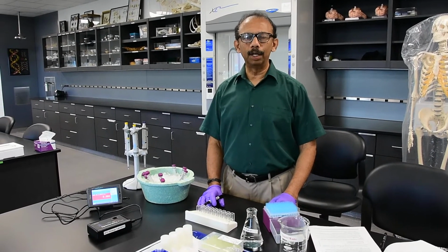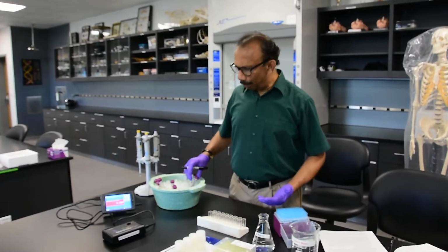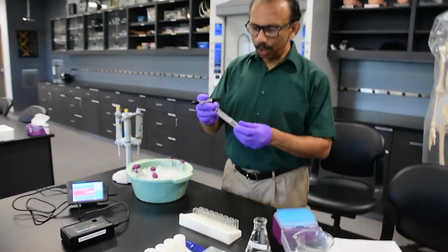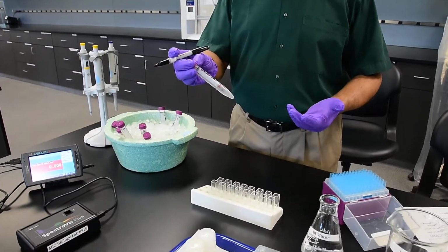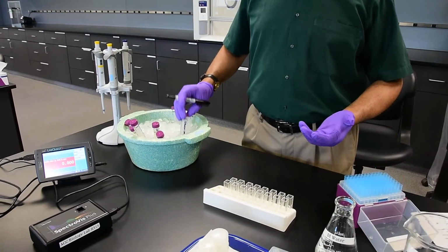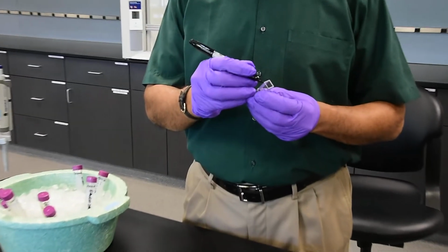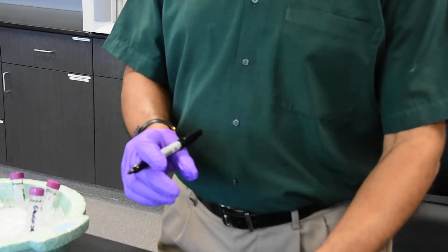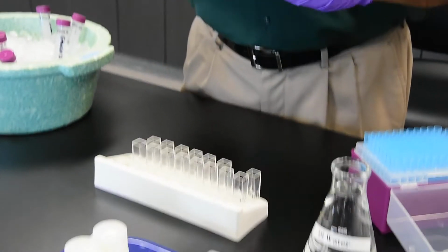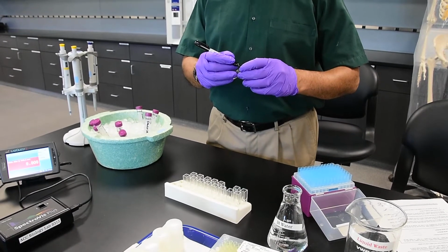So the first part of this experiment, we are going to study the effect of substrate concentration on the enzyme activity. You want to always be careful not to mix up the substrate with the enzyme, otherwise the reaction will start right away. Okay? So what I'm going to do is to label the cuvettes. I'm going to label the cuvettes based on the concentrations, but you can also label them with a specific number so that you know which one you are using for which concentration.